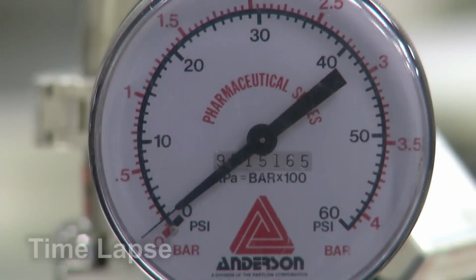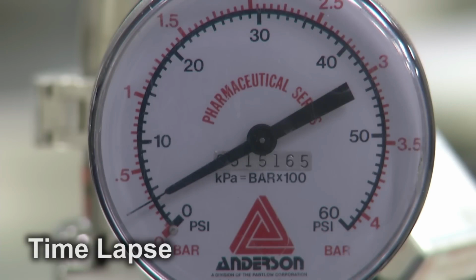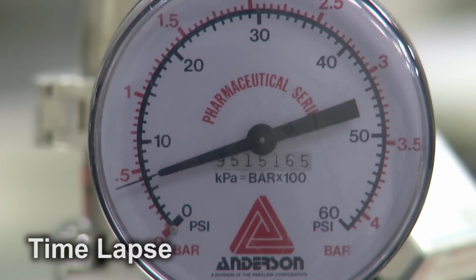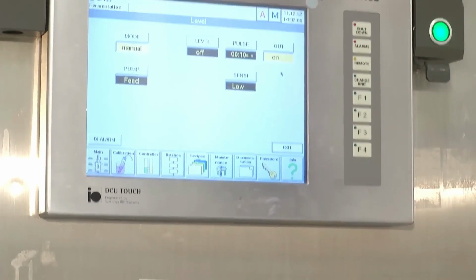The bioreactor is brought up to normal process pressure and held there in order to check for leaks. The pressure is monitored over a 30-minute period. If a leak is detected, the problem is corrected and the test is run again. Once the reactor passes the test, we are ready to mix the media in the vessel.